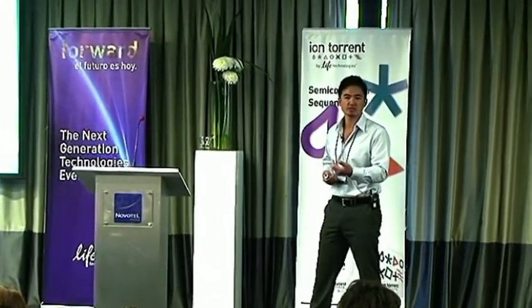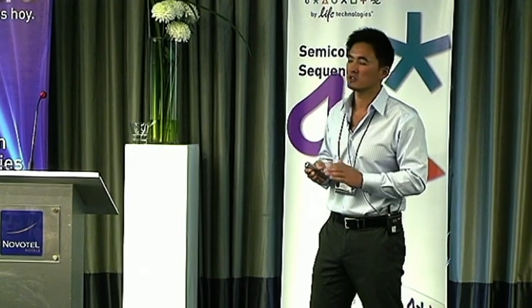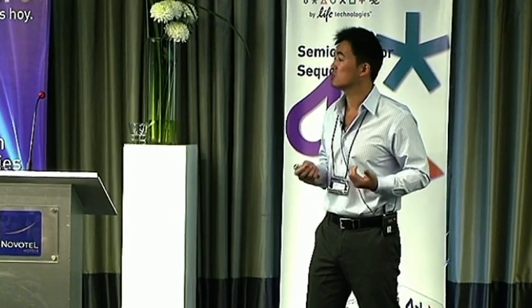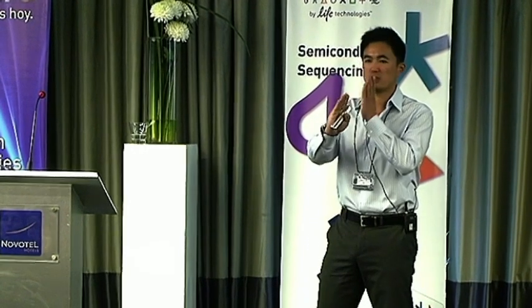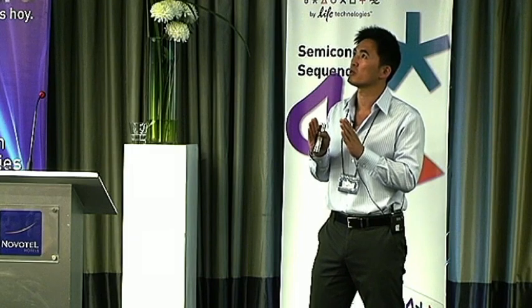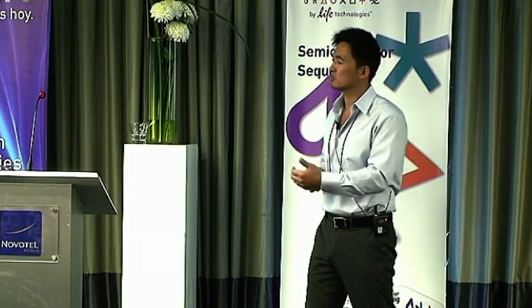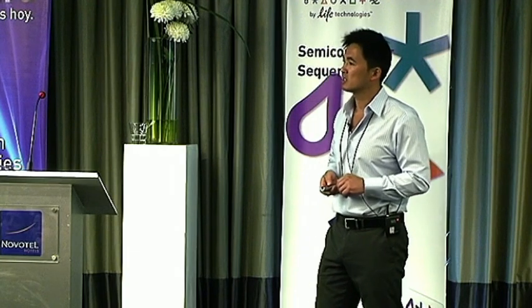That's a 20% difference. If you mathematically think back to a 20% difference in copies, in qPCR the amplification plots would be right on top of each other, practically, right? Mathematically, I think they're 0.3 cycles apart. So you can't really, with confidence, say that there's a true 20% difference in copy levels.